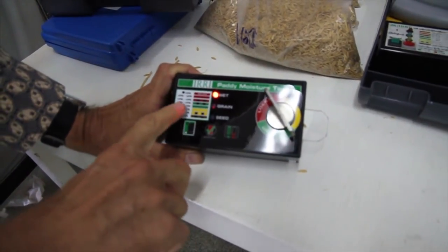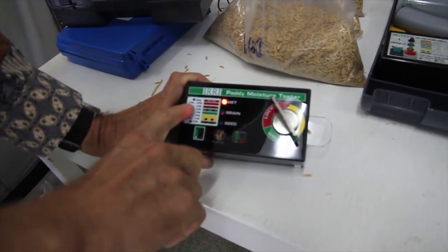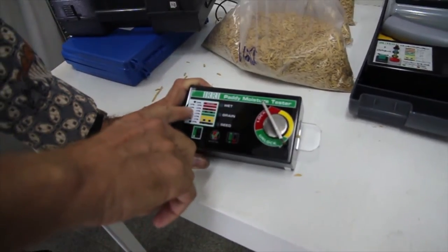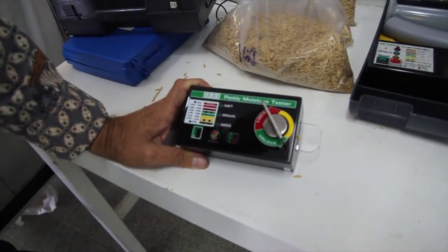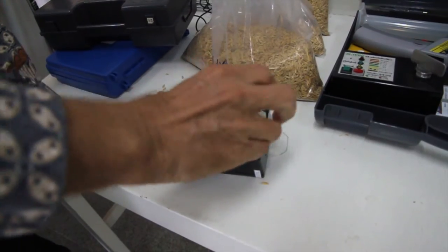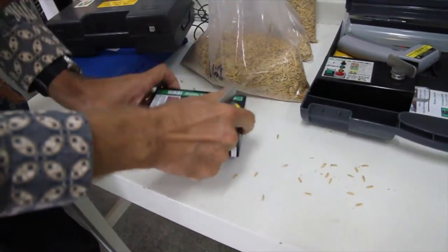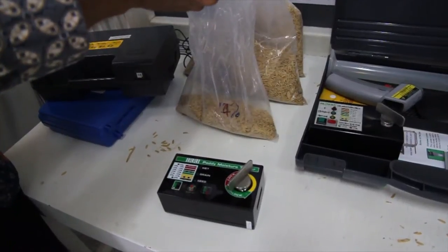From the pattern of the light, we can even tell what moisture content it has. If it's permanently red, then the moisture content is between 15% and 16%. I now take another sample, which should have around 14% moisture content.